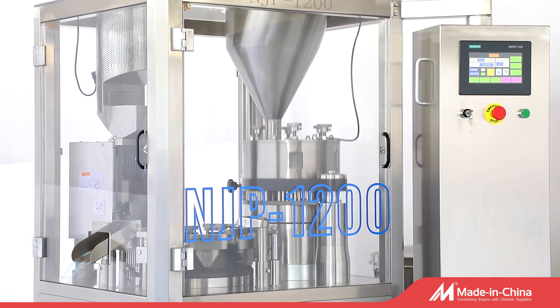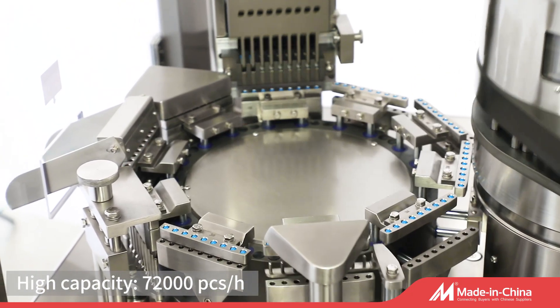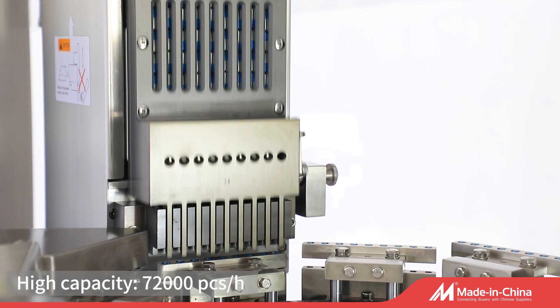The NJP 1200 is designed for filling powder pellets into capsules. The machine can be divided into upper and lower components.